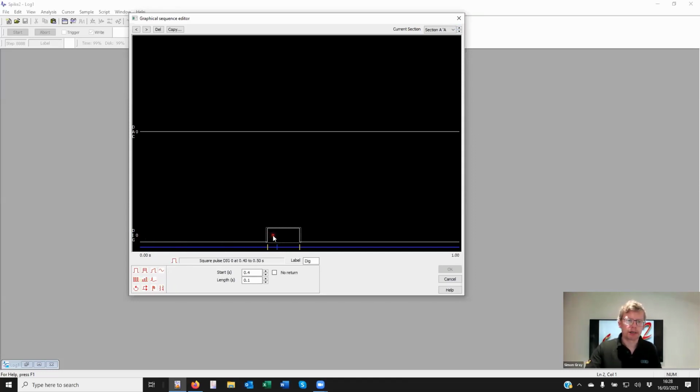I'm sending out a digital pulse here, and at the digital pulse transition time to high, I'm adding to variable number 1 a value of 1. So this is going to increment. Here, I'm setting a wait for again, and that's when time is reached. For that, I've given it 15 seconds. So when sampling time has reached 15 seconds, then continue on. So on a key press A, time for this section starts. We run through, it gets to 0.4 of a second.